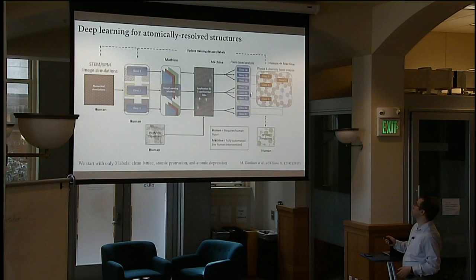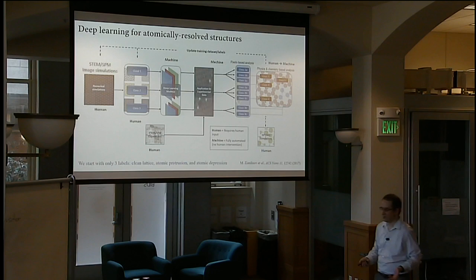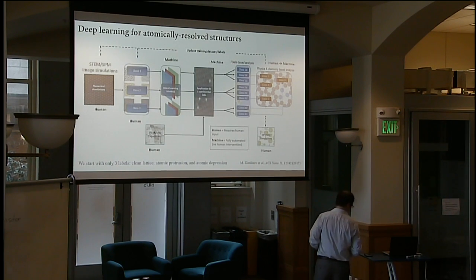And then here you will typically end up with dozens of new defect classes, and then you can plug them into the simulations, and then you will update your training set, and then instead of 3 classes, you will have like 20 or 30 classes. So this works.